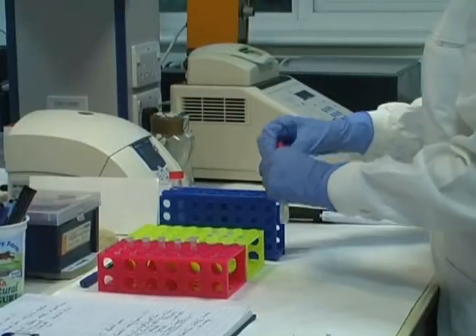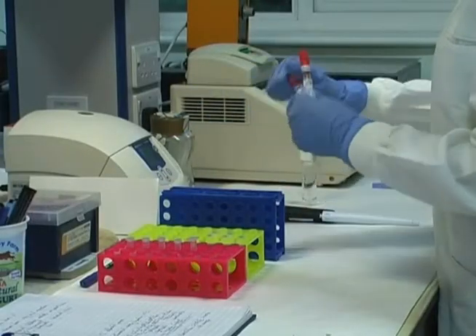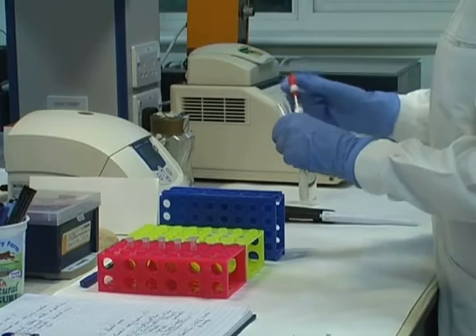Welcome, in this basic bite we will be discussing what PCR is, how it works, and the sorts of equipment that is used to perform the analysis.